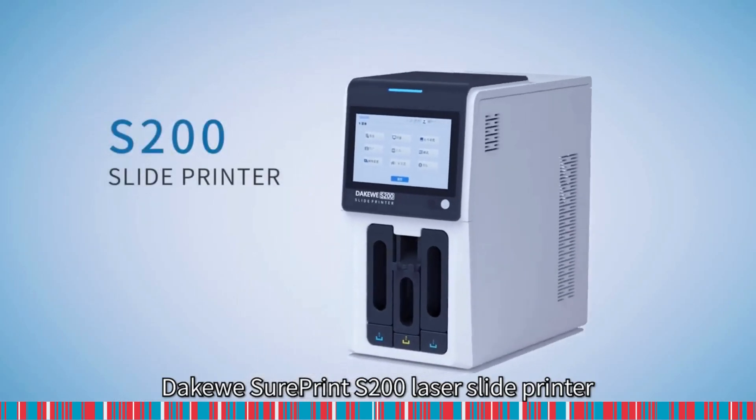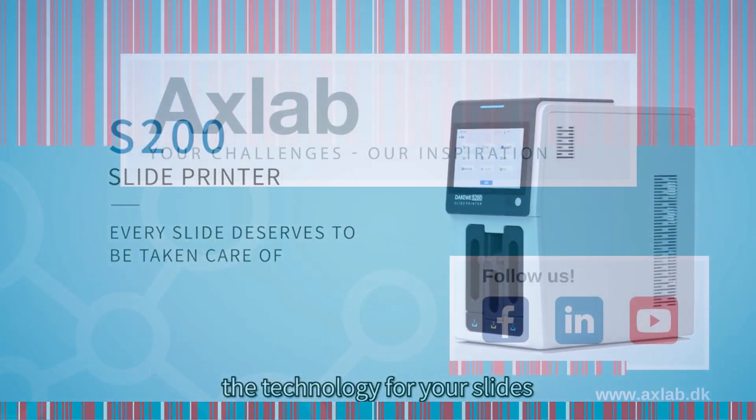Dakewe SurePrint S200 Laser Slide Printer. The technology for your slides.